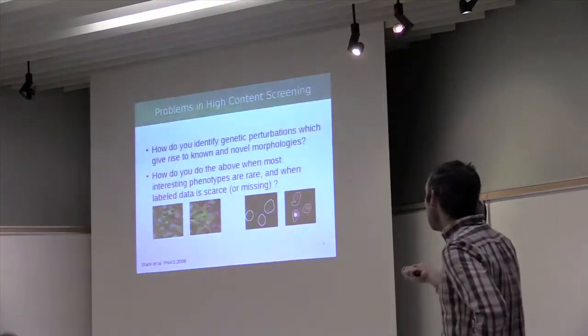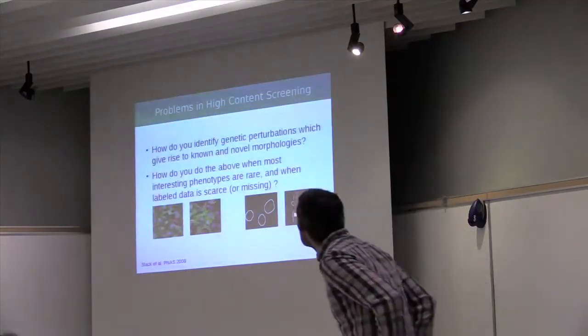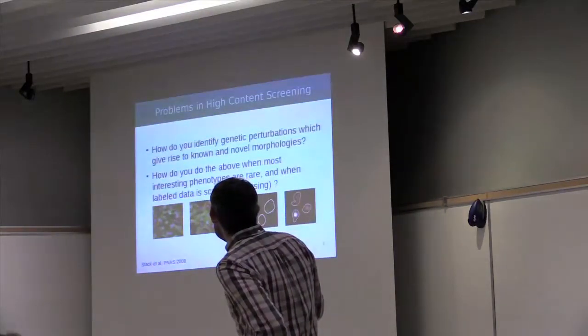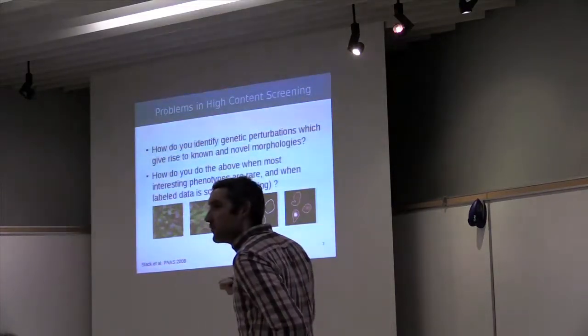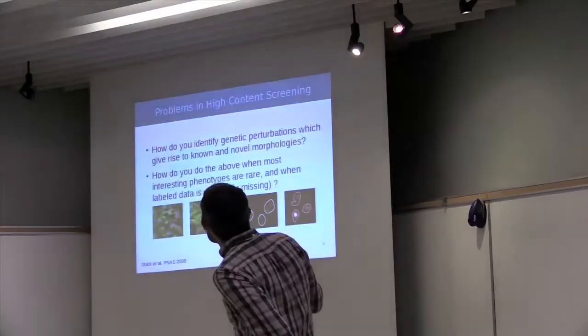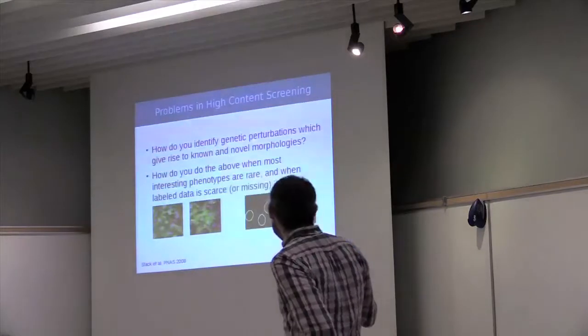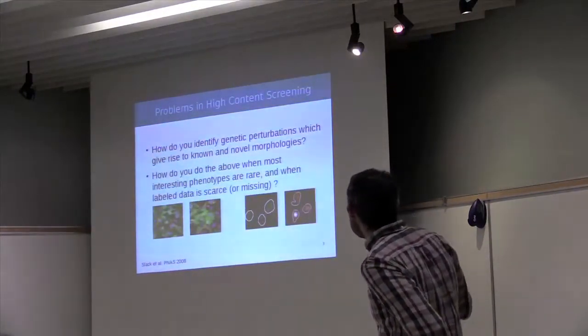So here there's an example of these, where the original quality is better. On the left is an example of a drug study in mammalian cells looking at what types of drugs affect the morphology, these are human cells of some variety. And on the right are some of our own images of yeast cells bearing a couple of interesting phenotypes.